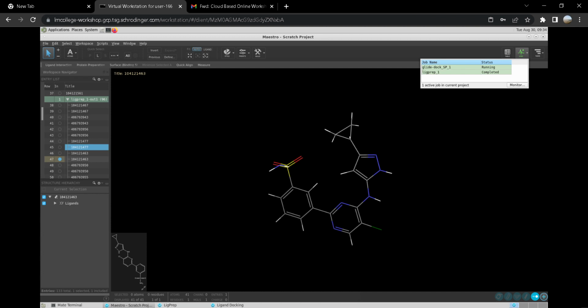It seems my calculation is over. Anybody else who has launched the calculation?